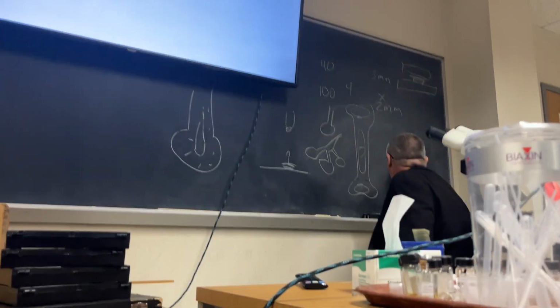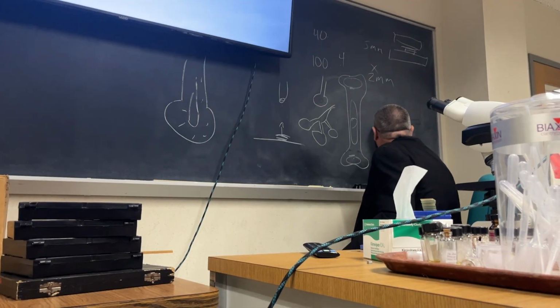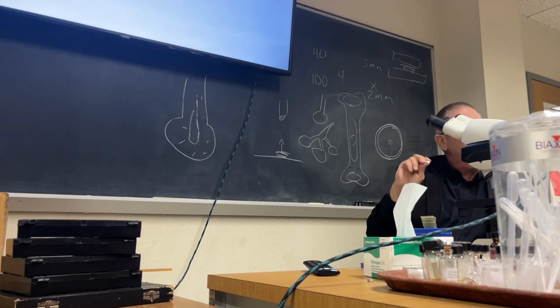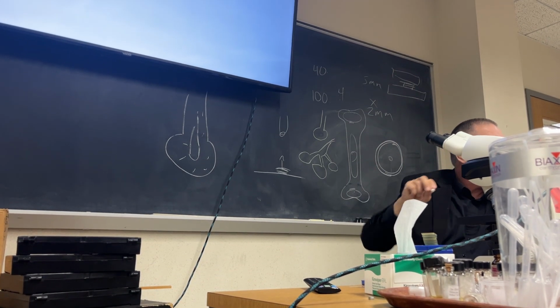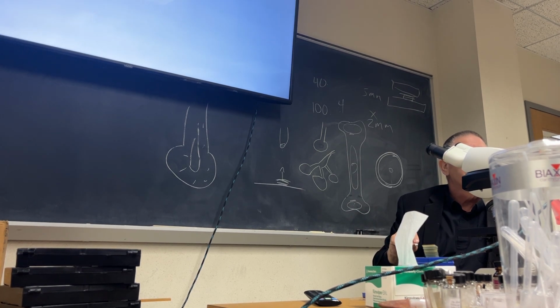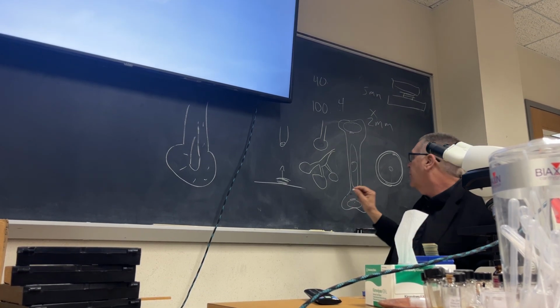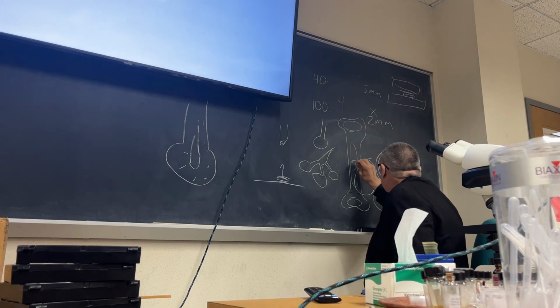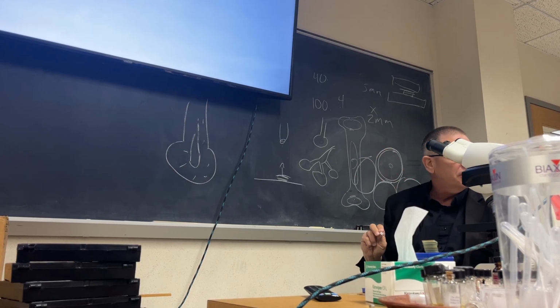And then your endomysium is going to be right around the edges of it. It will either connect to it or not, depending, but it should be fairly close to being connected to it. There might be a small gap. And then, of course, you have all the ones around it, and they're all over the place. Does that make more sense now?